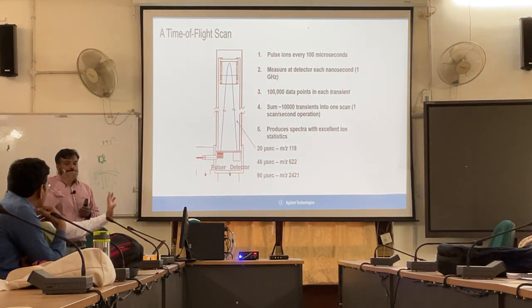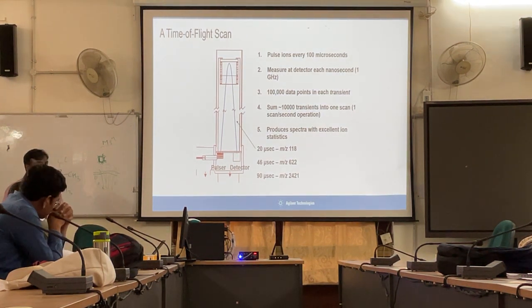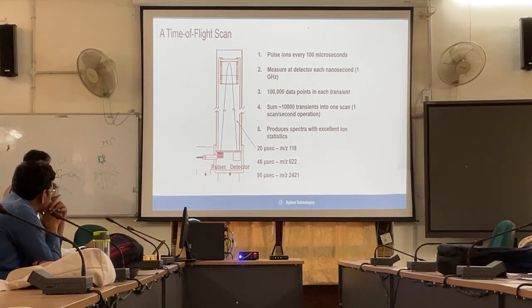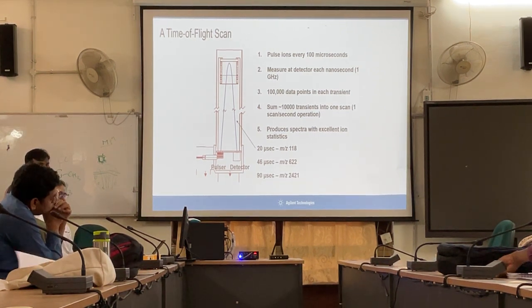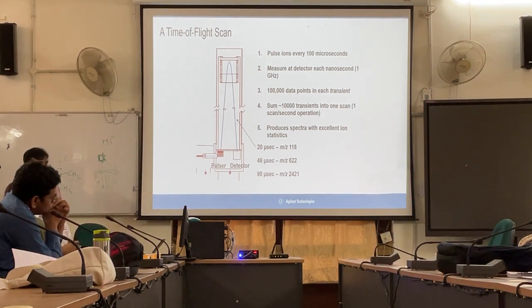So this calibration is only for the TOF, meaning it is calculating the time from the place the ions enter the TOF tube until they reach the detector. If you calibrate the whole instrument as such, it is called tuning. That is a different procedure, because there you make sure that the molecules travel because of the voltages, so you adjust the voltages there. Here you don't adjust the voltages. In calibration you don't adjust the voltages.